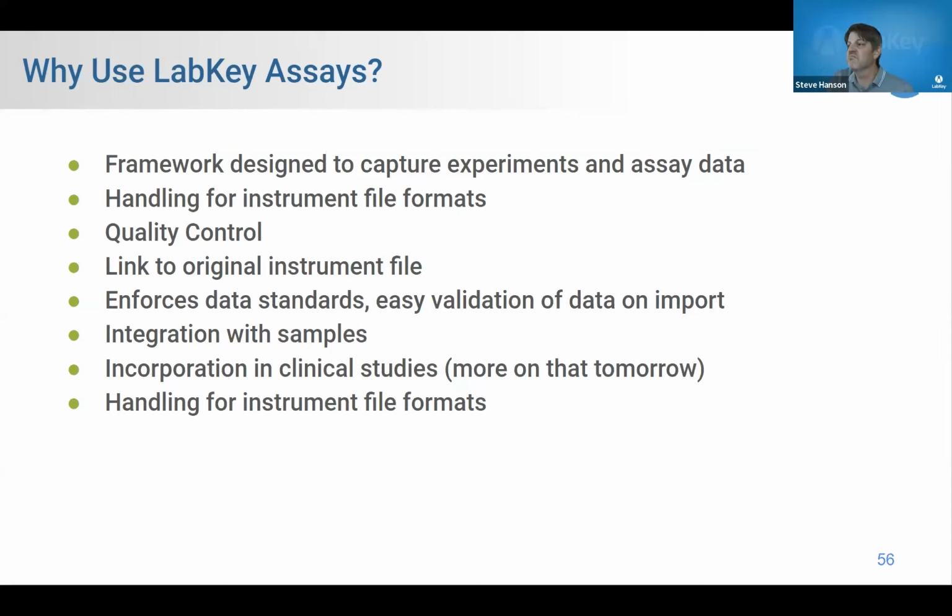I don't really think so. I haven't heard about it. LabKey performs well. I mean, there's a lot more going on than just the audit log when you have hundreds of users. Honestly, if anything's slow in LabKey when you have lots of users, it's when lots of users are looking at the same thing. If you've got hundreds of users and they're all working on that one table, that can slow things down. And the table is really big. That's where slow is. Auditing, I don't think it's a problem.